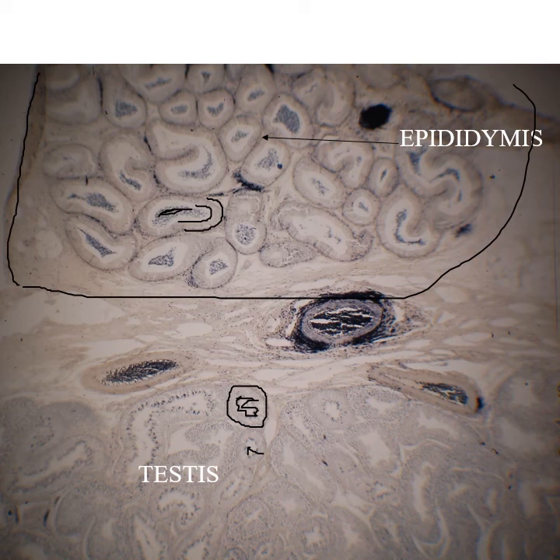If I want epididymis, I usually give it to you like this, so you can see it right alongside the testes. These big things here, these are arteries and veins. Don't worry about those yet. This is a connective tissue between the epididymis and the testes.